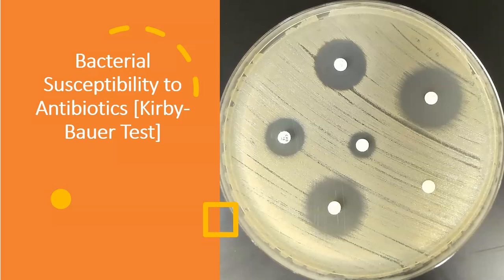In this lesson, we'll be talking about the Kirby Bauer antibiotic susceptibility test. There are several different types of antibiotic susceptibility tests. This one in particular is a way that we can test a single bacterium against various different antibiotics by exposing the bacteria in a dish to those antibiotics and seeing if the antibiotics are able to inhibit bacterial growth.